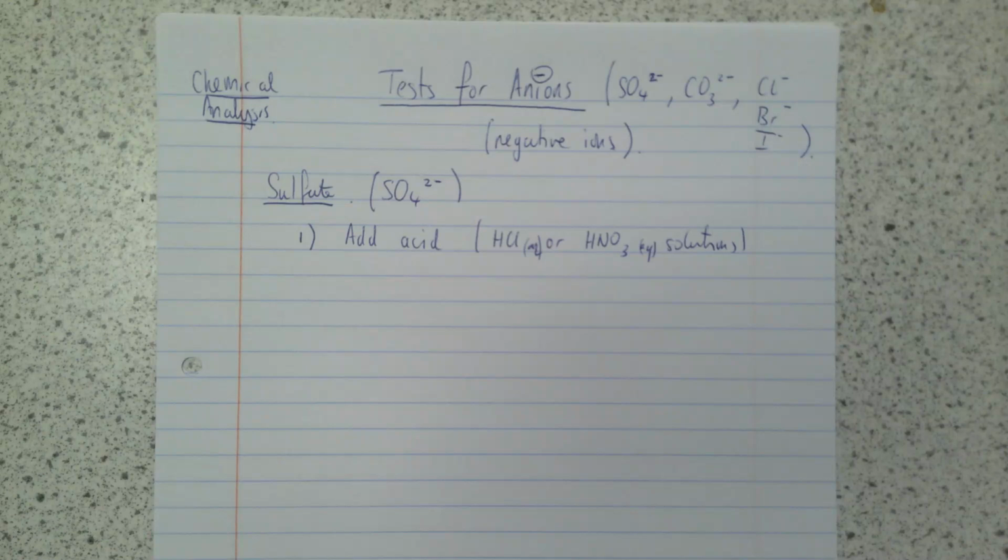If you don't add the acid, what can happen is that there might be ions present in your sample, specifically carbonate ions, that would spoil the test.